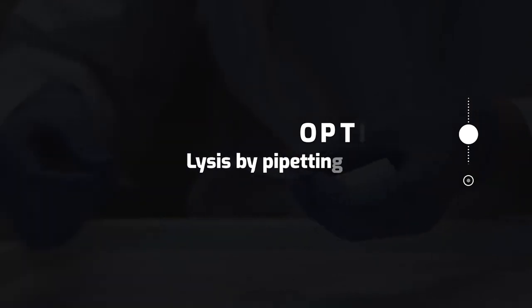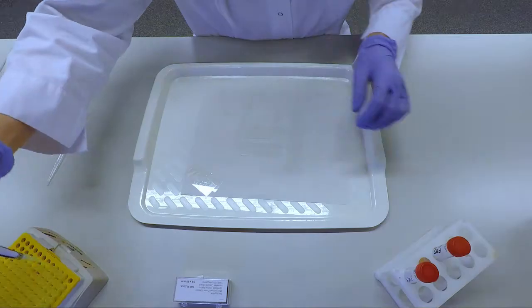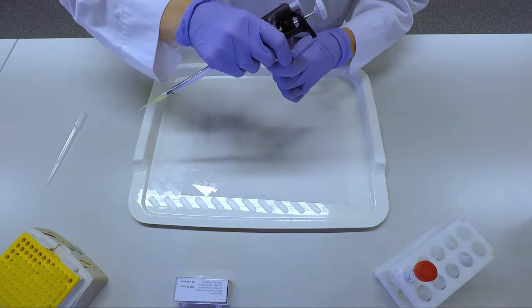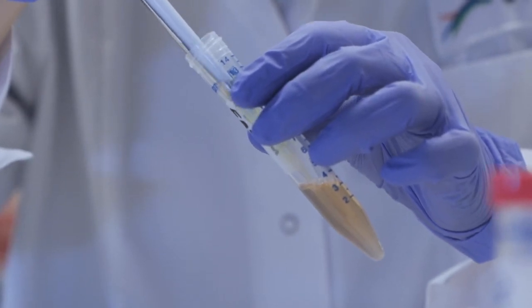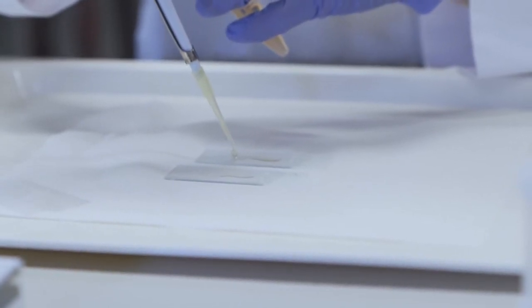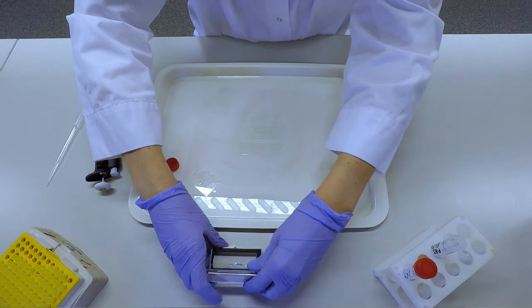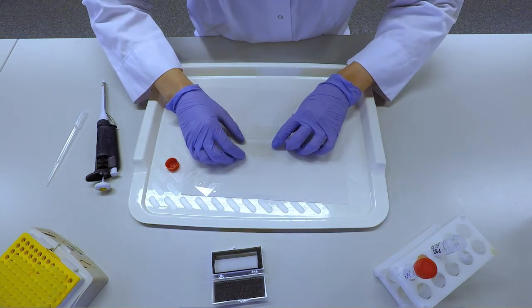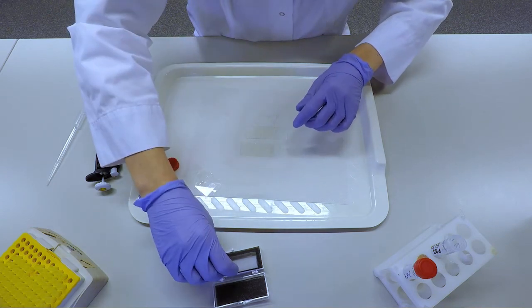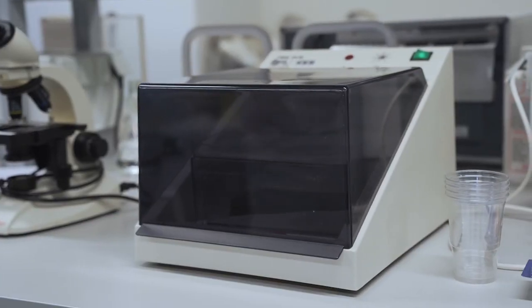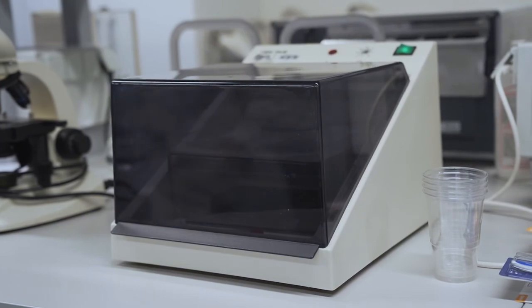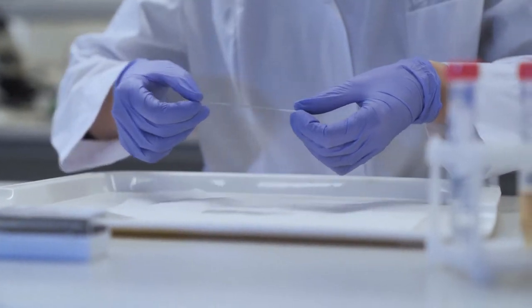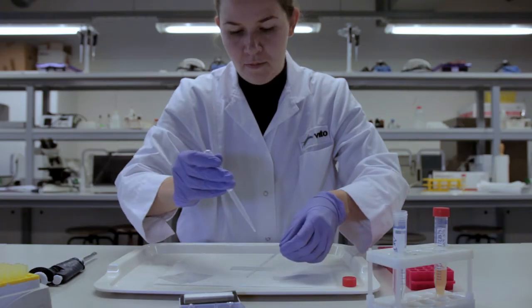Remove the coverslip and put 50 microliters of 0.25% trypsin. Cover it again with a coverslip and keep it at 37 degrees for 30 minutes horizontally in a metallic, plastic, or glass tray that is already heated at 37 degrees Celsius and with a wet paper inside. Remove the coverslip and gently wash the slide with distilled water.